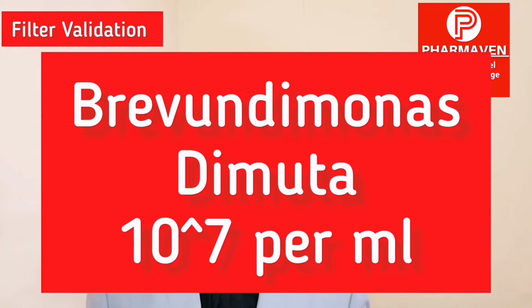So what do we need for the validation? We need culture media with 10⁷ per ml concentration of Brevundimonas diminuta. So this culture media is required. We need a vessel to make the media, then the filter to be tested, then two control filters: one is for negative control, and one is to check whether any bacteria come out of the test filter, to retain that bacteria.